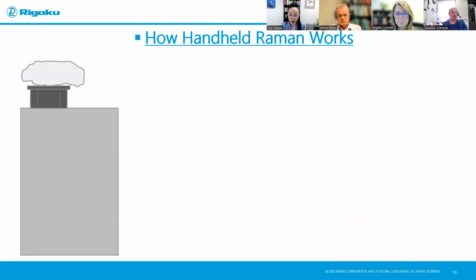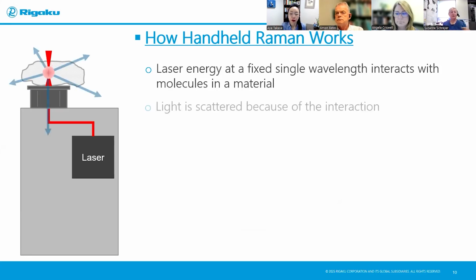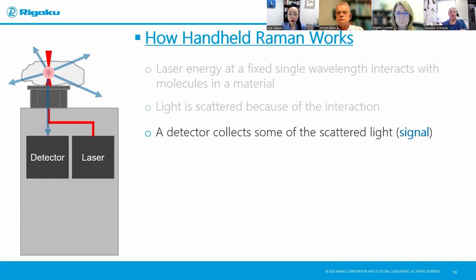So we start off with, so this is a little cartoon of our instrument. We have a sample that's held against the nose cone, like so. We scan the laser into the sample. It traces a diffuse reflectance path through that sample, and then that will come back into the detector.